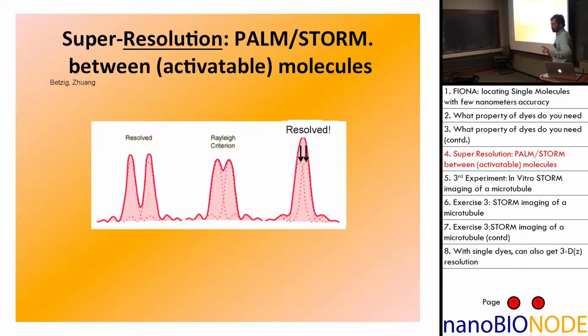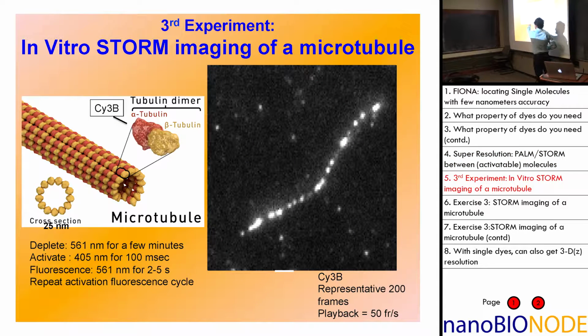What you have with super resolution, we're just going to go over this. If the two molecules here are far enough apart, you can determine them. As they become closer together, you start having trouble separating them, and when even closer together, they're unresolved.